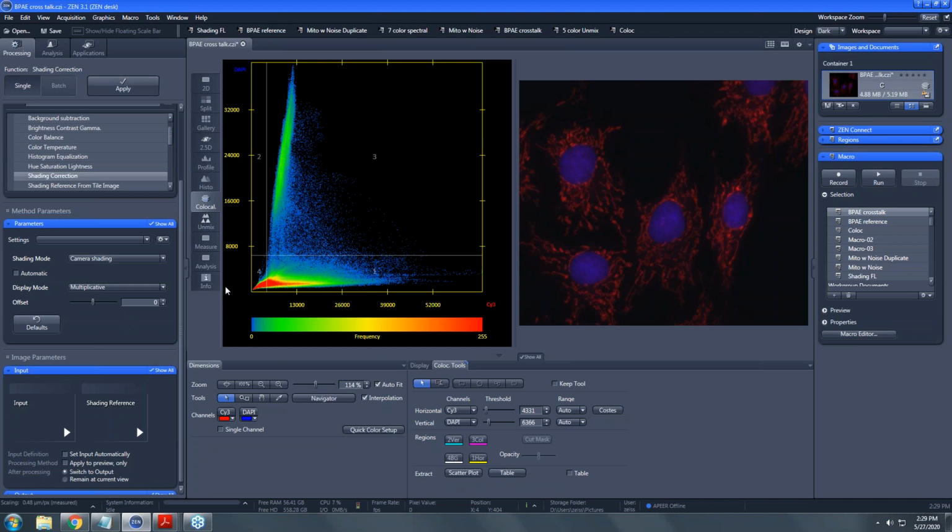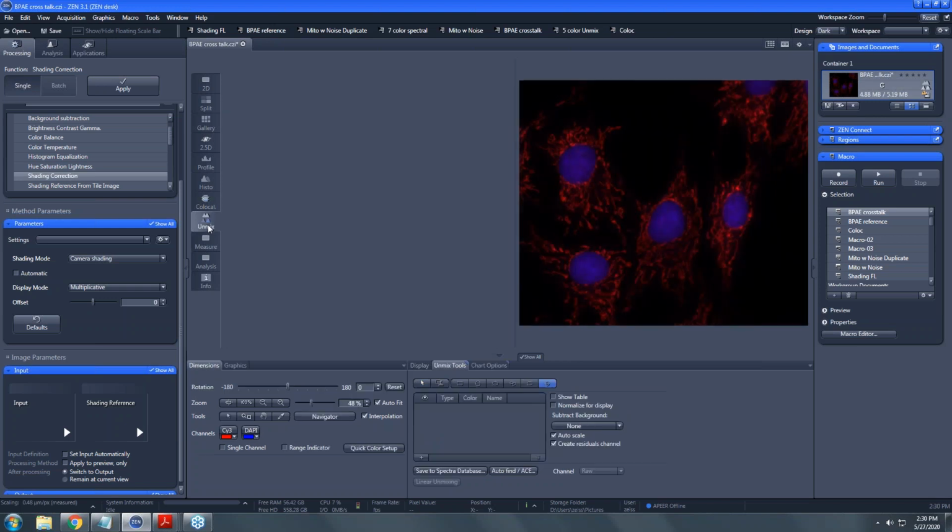Now we can unmix that because these two things are spatially distinct. We can ask the software to look at what's happening here, and we tell it we have two distinct fluorophores, and that's what we're about to do. So this is a really quick and dirty spectral unmixing, and we're going to get progressively more complicated spectral unmixing cases, but we thought let's use a really simple case where it's very clear. So yeah, let's start with the unmixing.